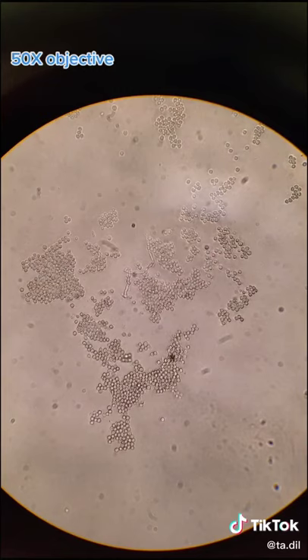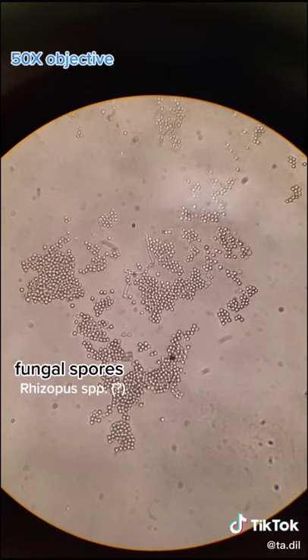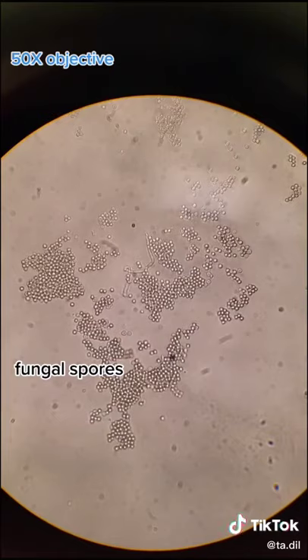In the first sample we can see mainly fungal spores. Based on the morphology of the growth on the plate it could be rhizopus, which is a common bread mold.